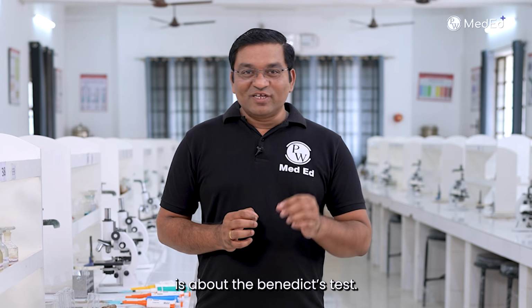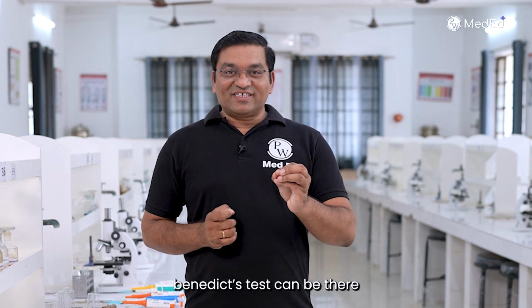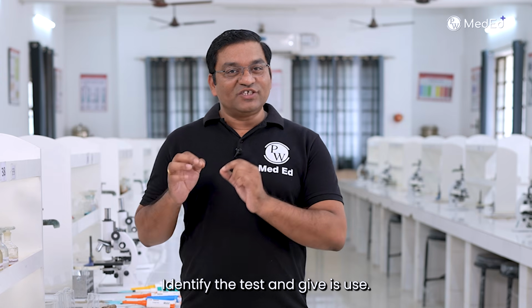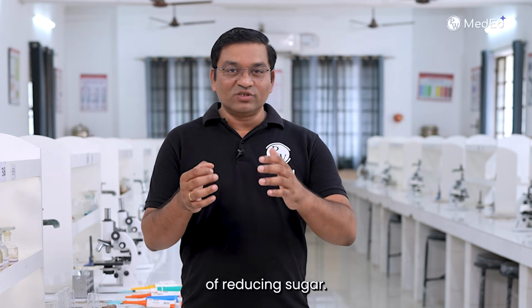Hello students, today's demonstration is about the Benedict test. All of you know this is the most commonly asked test in the examination. Benedict test can be there in the spotting for the 1 mark, identify the test and give its use. So it is a Benedict test which is done for detection of reducing sugar.